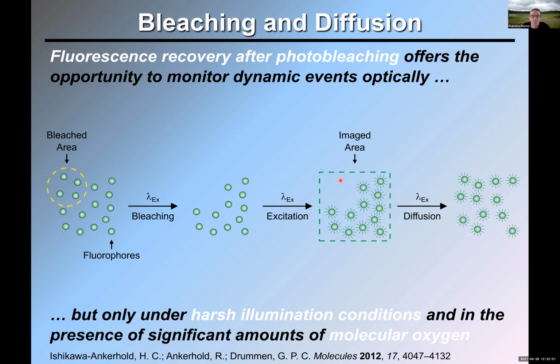One limitation of this approach is that the bleaching step requires very harsh illumination conditions. You need to illuminate with very high power densities in the presence of oxygen for a fairly long time. So for some biological applications, this is a problem.